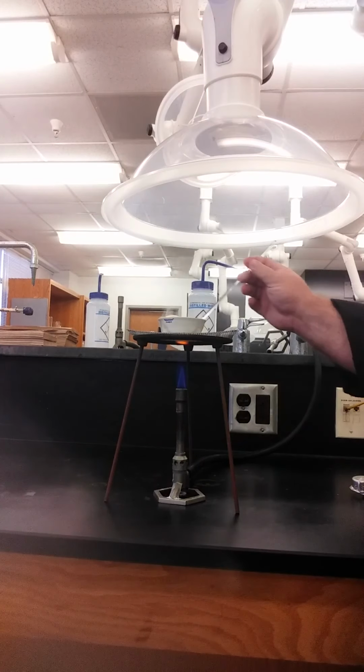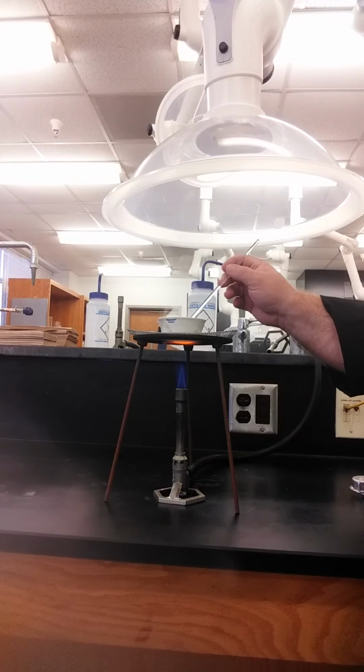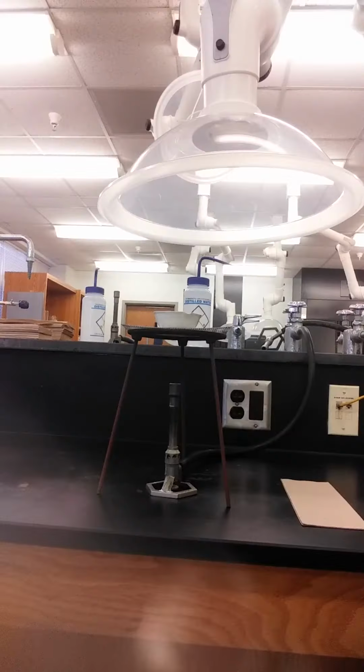Once the fumes begin to subside, gently stir the mixture with a glass stir rod. Be very careful not to burn yourself during this process. After about 10 minutes, the ammonium chloride will be completely sublimated, and the fuming will cease. At this point, turn off the burner, but do not touch the evaporating dish. It will be extremely hot.